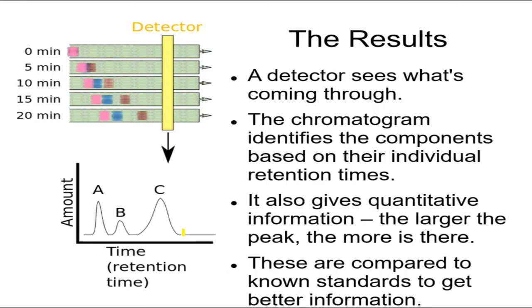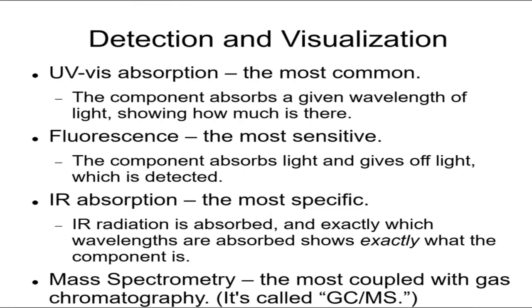Which you would see over here. Here's, let's say, light shining in it. Suddenly, it's fluorescing at a different wavelength. The detector's detecting it, so it's going to give a good signal here. That's how that one works.